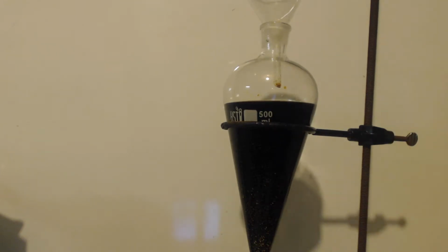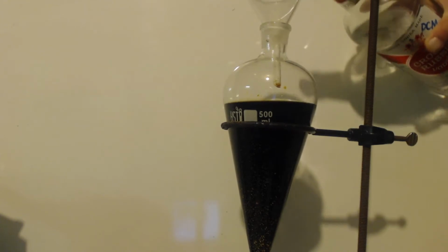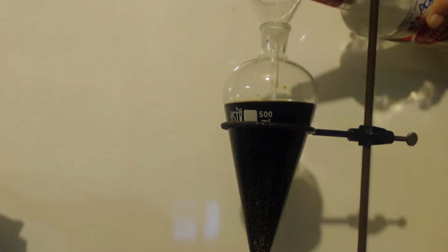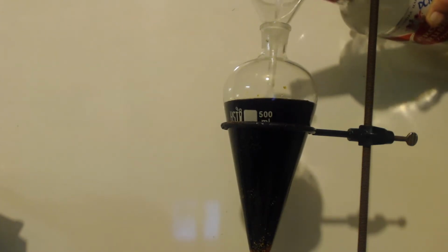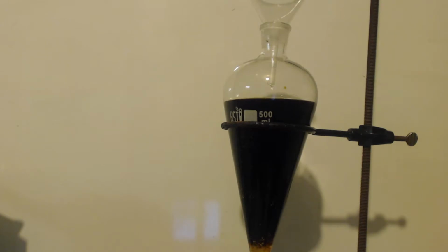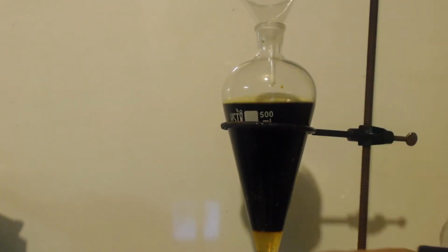So I got done filtering it. I put it in this sep funnel. Got some DCM. I toss a little bit in there. Not really measuring it. I just want to see a layer. There we go. That's good enough. You can see down at the bottom, that's the DCM. So I'm going to shake that up and vent it, shake it, vent it, shake it, vent it. I'll do this twice, wash it with DCM.